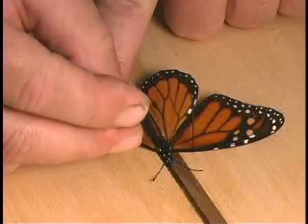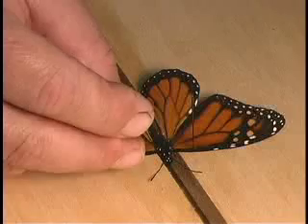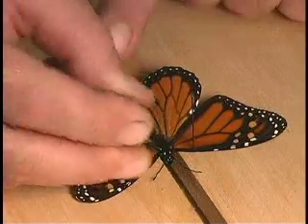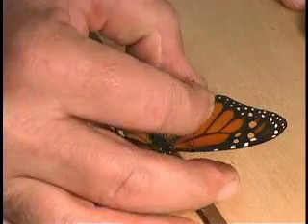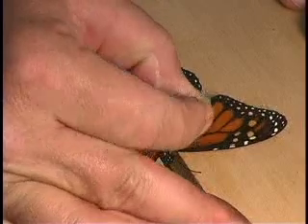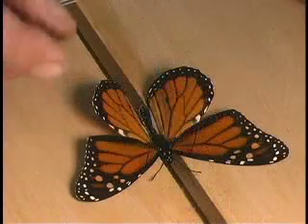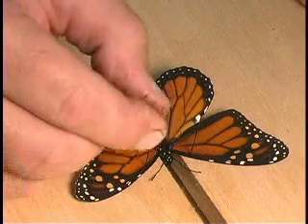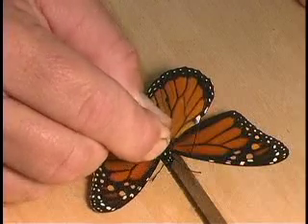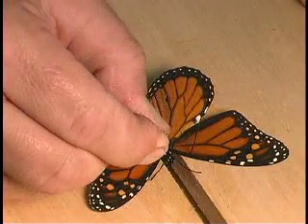Then repeat that on the other side, pulling that wing slightly forward. Continue to move each side forward a little at a time until the bottom margin of the forewing is perpendicular to the body of the insect. That is the general rule of thumb when mounting Lepidoptera, that the bottom margin of the forewing is perpendicular to the thorax.